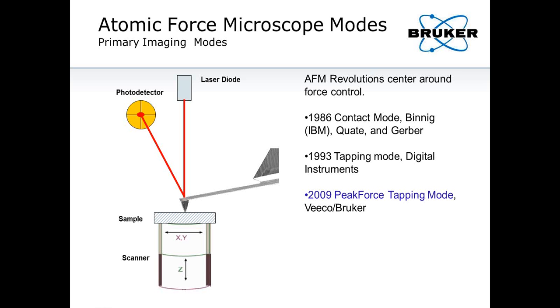So you have to have a parameter or physical quantity that depends on the separation or distance between your tip and sample. So when you scan point by point, at each location, the tip stays right on the surface or a certain constant distance above the surface. That way, you can trace out the surface topography faithfully.